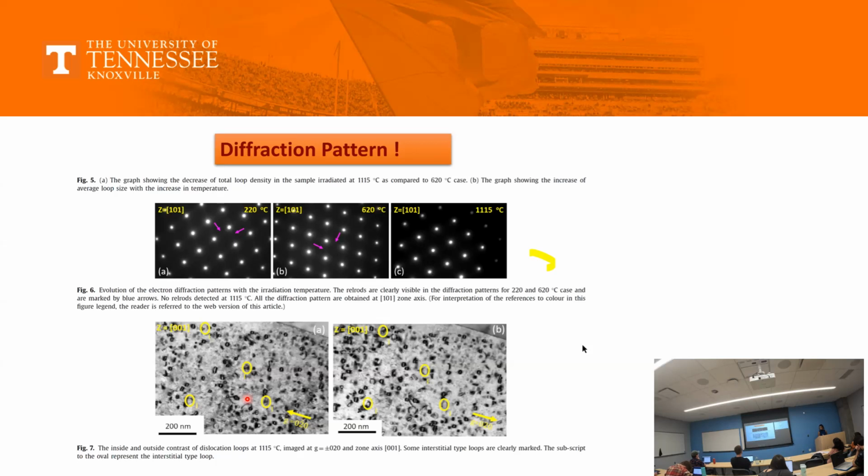And I'm just giving you a brief summary of what we are coming across in the slides. And the people who will do dislocations, that's what they will do. So here there are two examples. One is the example of your perfect loop and imperfect loop. So in a perfect loop, what do you see? There's a proper, so do you see, there are two contrasts on the image. One is a coffee bean kind of contrast.